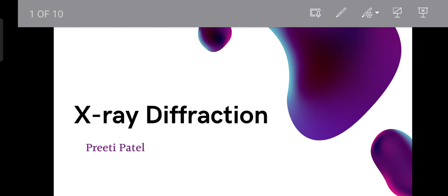So today we are going to cover the topic called X-ray diffraction. It is one of the important topics in advanced instrumentation techniques. Under this topic we are going to cover the definition of X-ray, followed by the working and the principle involved in it, and the Bragg's equation. So let's begin.